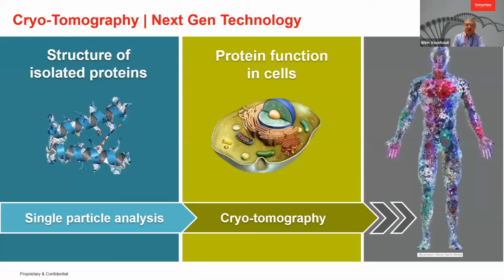So this was all on single particle. That has yielded a lot of results of isolated proteins, structure determination for drug development.